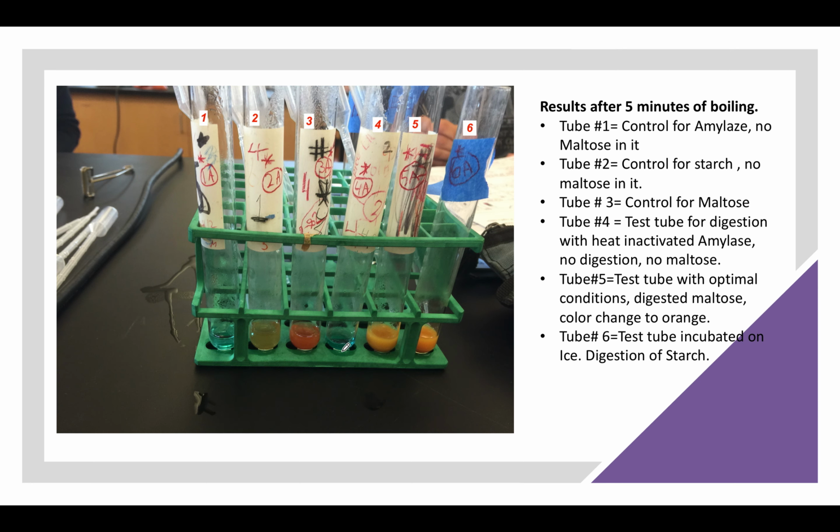Tube number 4: we added amylase and starch, but the amylase was denatured. So do we expect any reaction, any digestion of starch? Amylase is not working, so there won't be any maltose, and it will be negative, like the control.